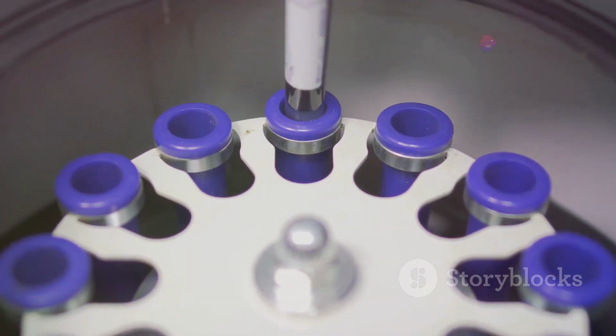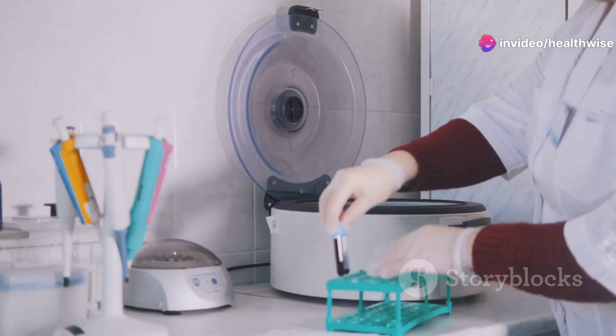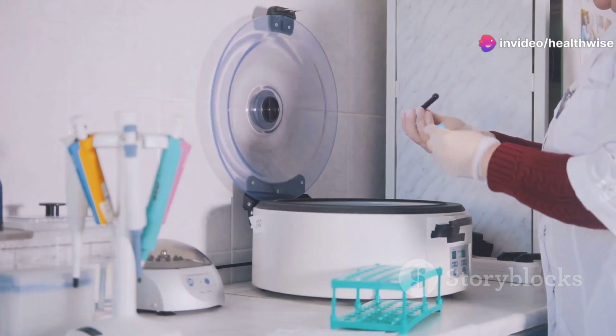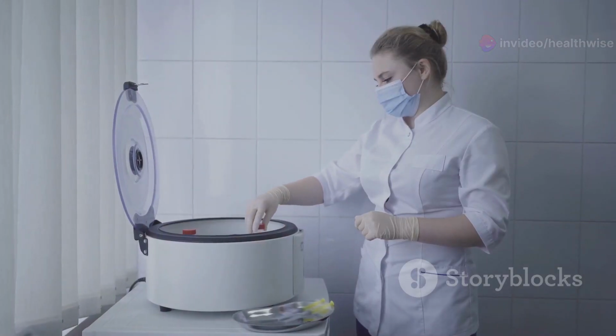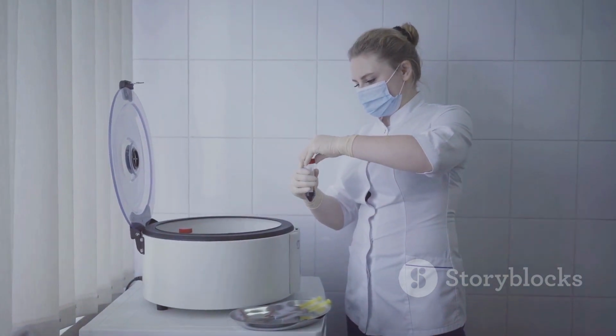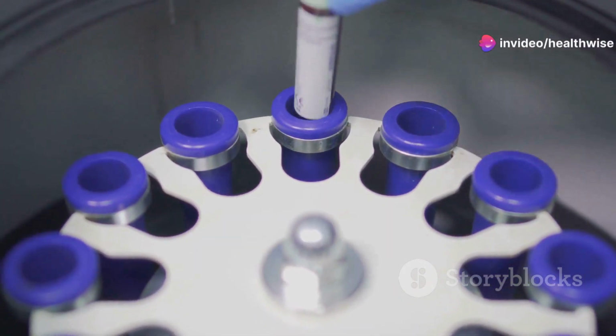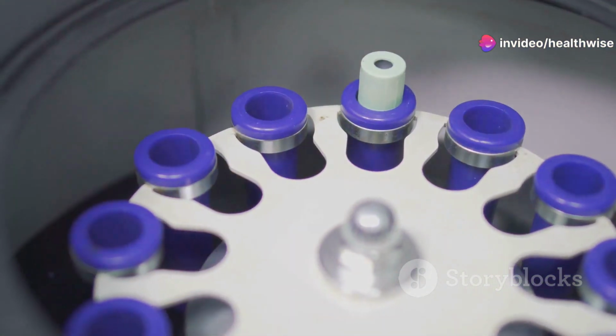In medicine, centrifuges are used to separate blood components, allowing doctors to analyze blood cells, plasma, and other vital components. In biology, centrifuges help researchers isolate DNA, proteins, and other cellular components for further study. Even in food production, centrifuges are used to separate cream from milk.